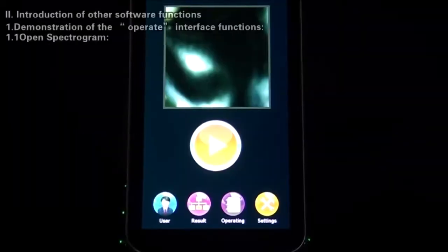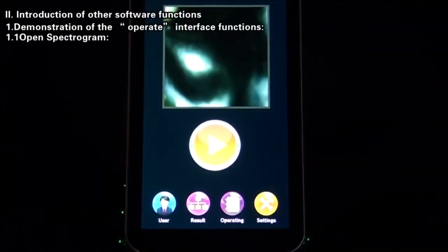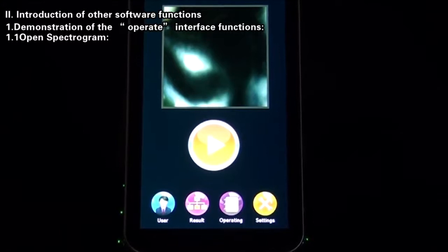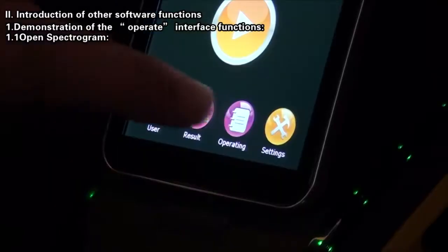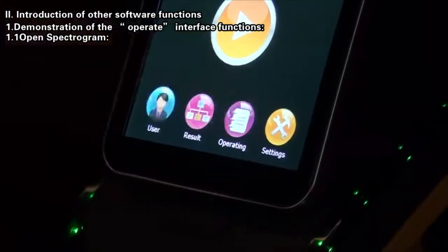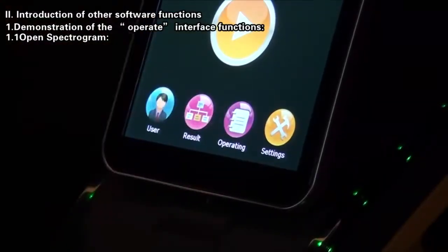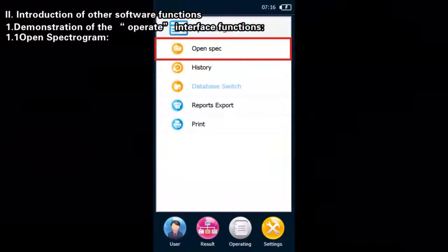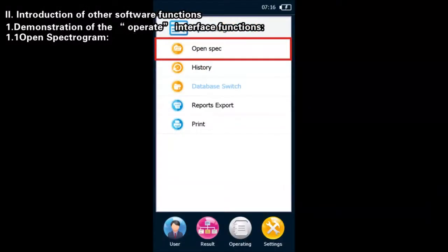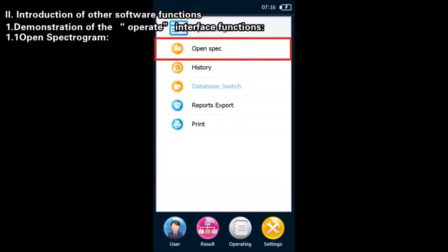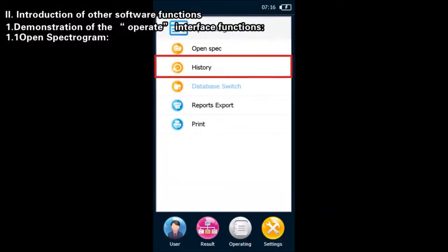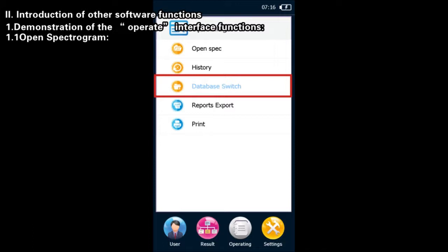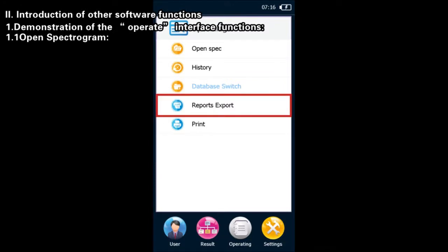Second, introduction of other software functions. Demonstration of the Operate Interface Functions: On the main interface, click the Operate button and you can see such options as Open Spectrogram, History, Database Switch Over, Report Export and Print.